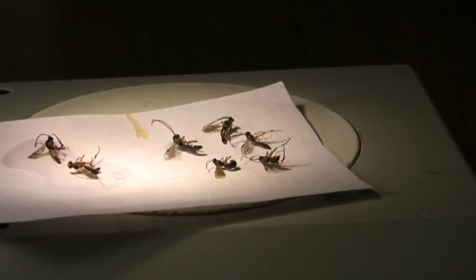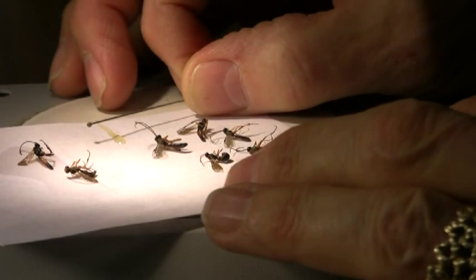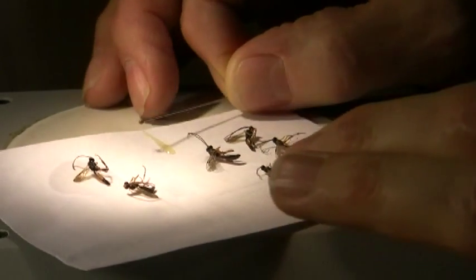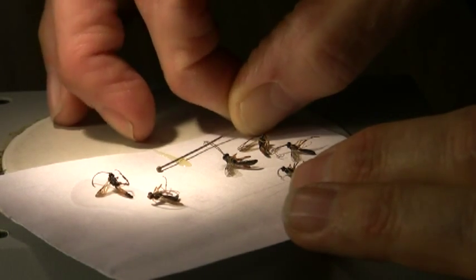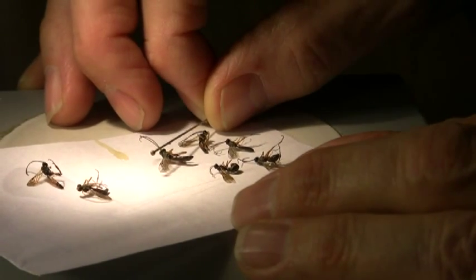I'm just going to put more of a line on the paper here in close proximity to the specimen. Then I'm going to take one of the number 1 insect pins, like the ones I've given you, and I'm going to touch it into the glue at about the position we want the insect to be attached, and so that's going to be down about 1 centimeter, like we've done with all the other specimens. So you just set it down in the glue, touch it into the glue till it gets a nice blob of glue on the side of it, and then move it over and just set it on the insect specimen.